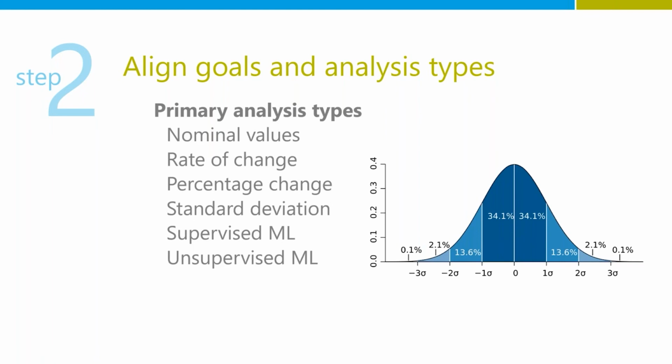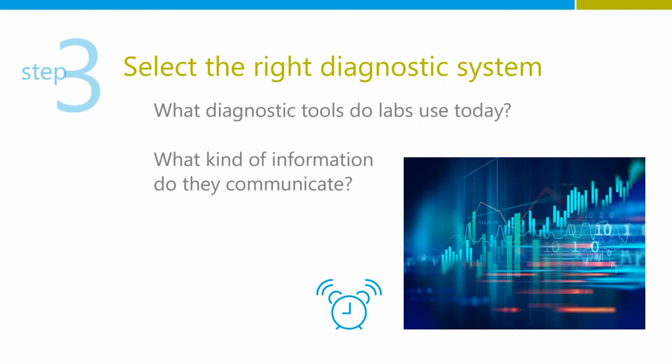I'm going to jump right into, just for the sake of time, because I want to make sure that it's on time. Okay, so we now have established, hey, we're going to use percent change as the best rule of thumb for this specific test or this group of tests, or we're going to use some supervised machine learning to classify this data.